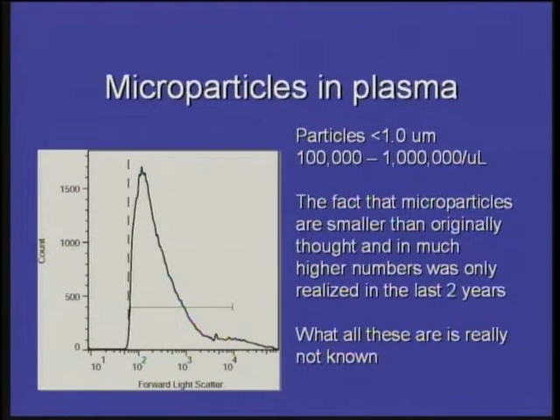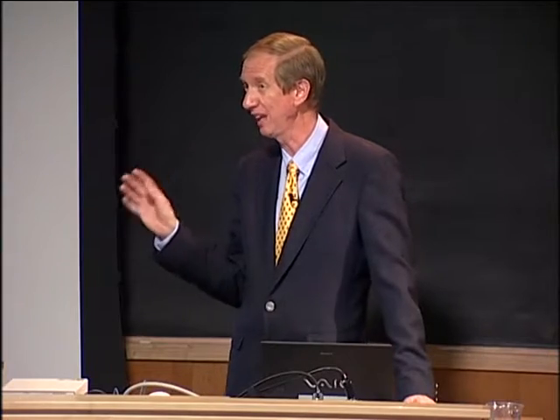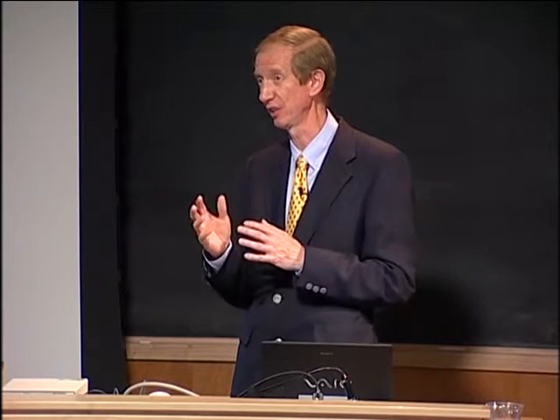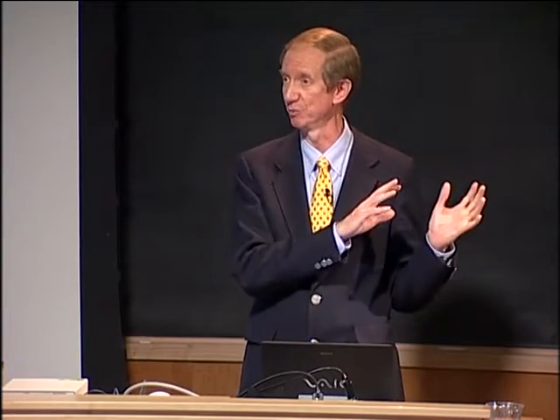I mean, I guess the microRNA is another world like that that's out there. But from this world, it's sort of interesting that we've got something new to play with that nobody's really quite sure. Because what we've been looking at before was literally less than 0.1% of what was actually there. And it may not represent the same population even as what you might call the true microparticle population, because it looks like a lot of what they were seeing is actually small platelets and maybe other small cell fragments that aren't the same mechanism of release.